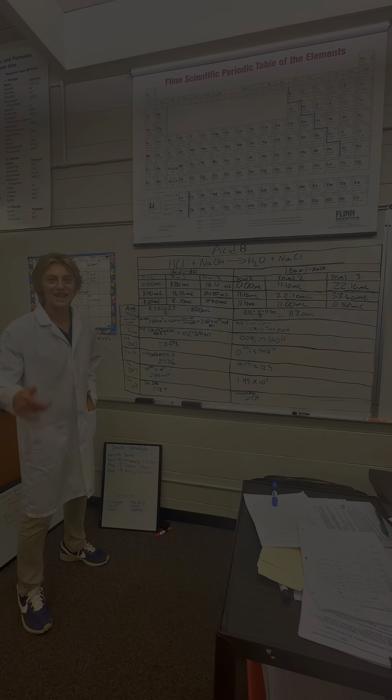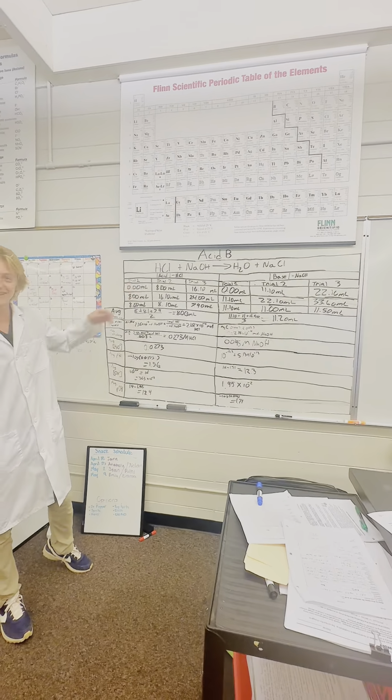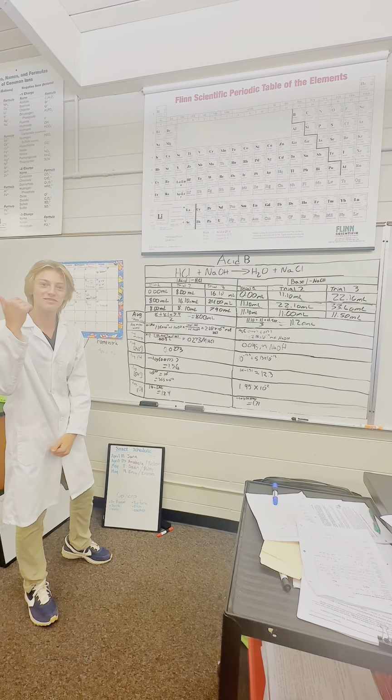Yo, it's your boy, Jake. We're doing science, acid B, hydrochloric acid. So my friend Parth has already explained this.